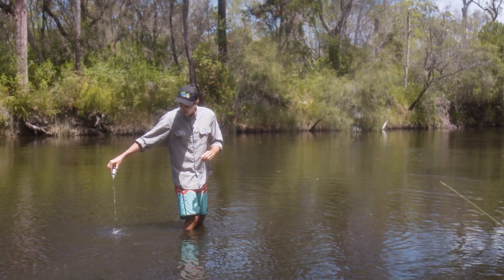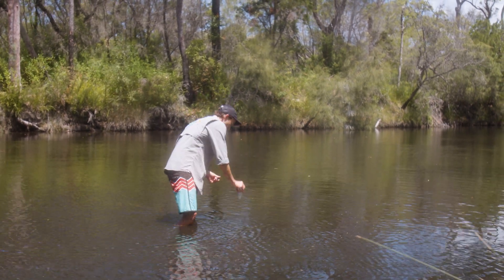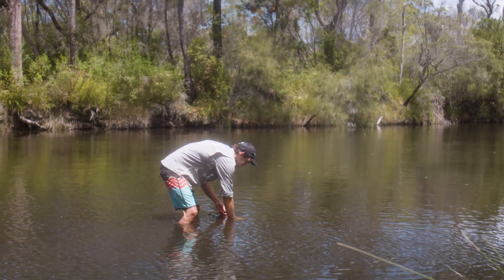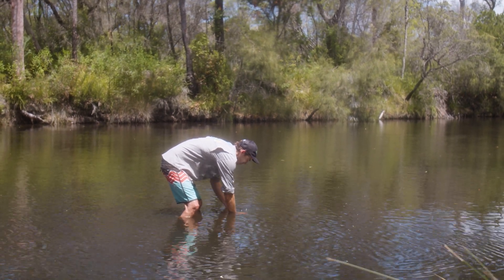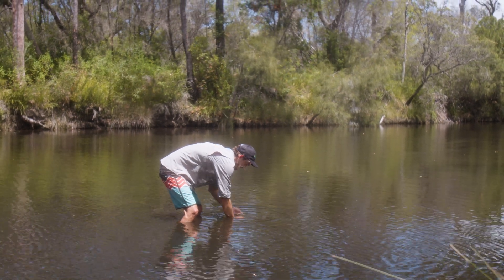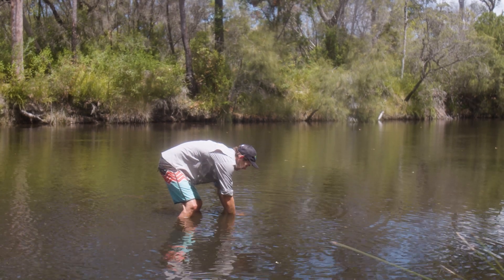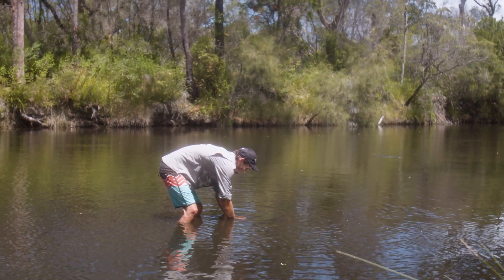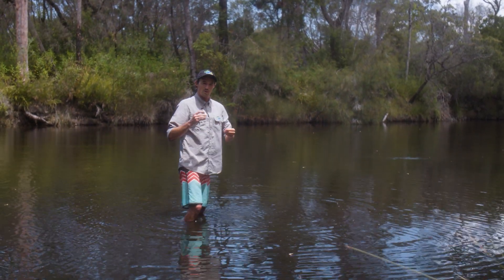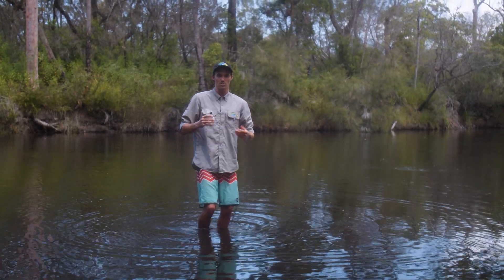Once you've done that we can take our final sample. For this you want to invert the jar, take it down to about 20 centimetres, turn the jar sideways, let all that air escape. Just make sure you tap the sides to make sure there are no air bubbles left at all. Then take the cap of the sample jar and screw that on underwater. Bring it up to the top, check you've got no air bubbles and you're good to go. We still don't want to leave it sitting around for too long before we actually do the test.